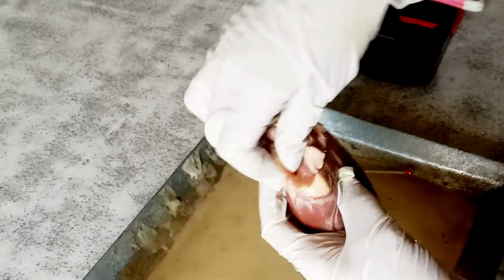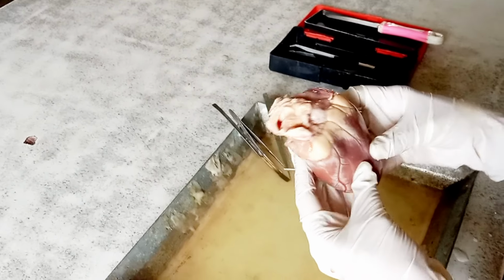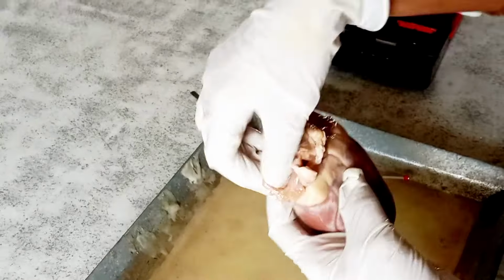You also can see arteries and veins here. One more important thing here is you can observe blood vessels on this heart, which supply blood to the walls of the heart. Can you all see? All these blood vessels are nothing but coronary blood vessels. All of you know that heart pumps blood to all the body parts. So, this is also an organ in the body and it needs blood supply to get nourished.